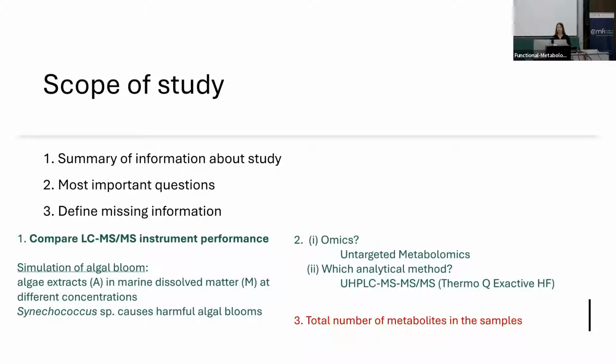So what kind of omics strategies are we going to do? You guessed correctly, we will do untargeted metabolomics. That's why you're here. And we will use ultra high performance liquid chromatography, mass spectrometry, and of course, acquire also MS2 data, or at least the samples that we will be given already have that. And the instrument is the Thermo Q Exactive.